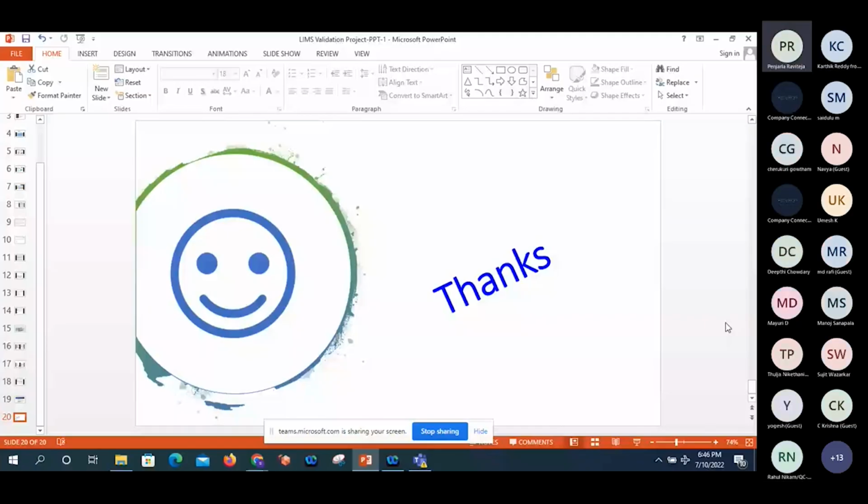Hi, in this training, are you going to demonstrate all the steps, like preparation of products, codes, master preparation? Everything you're going to explain? No. We don't have any application, and it's very critical to get the application from outside. So we will explain the life cycle approach for LIMS validation. In some of the slides I will explain, and I will get some things from Google and introduce them here in the PPT. Then I will explain some, but not 100%.